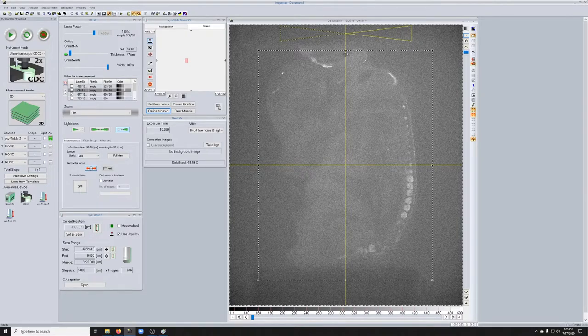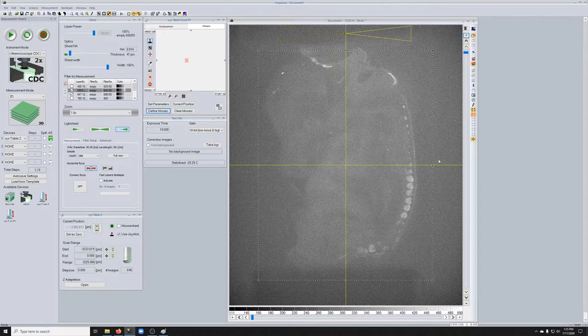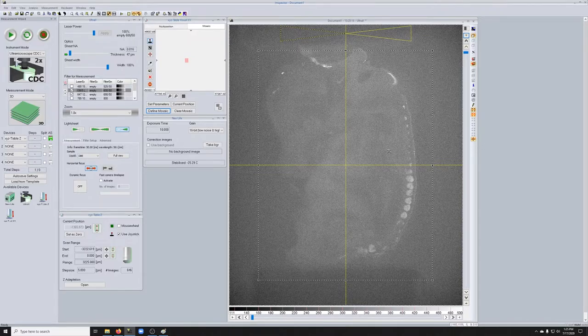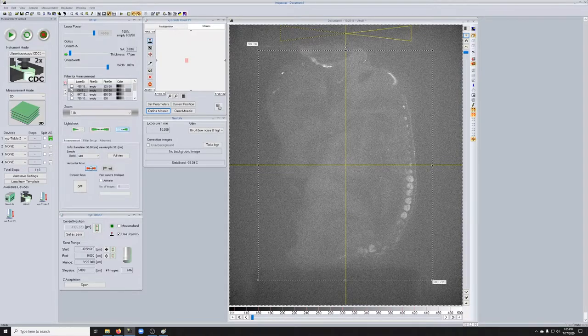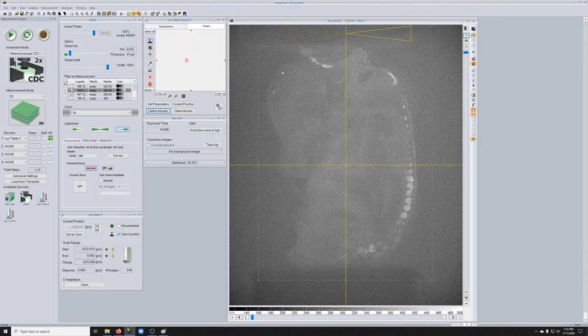...is by aligning these four squares to this crosshair, which again you engage there. So that seems pretty much well centered. Let me extend this a little bit here. Okay, so that seems like a reasonable cropping for this image.